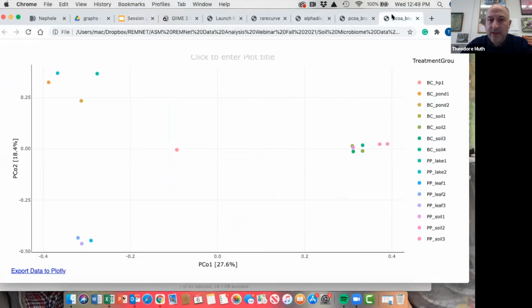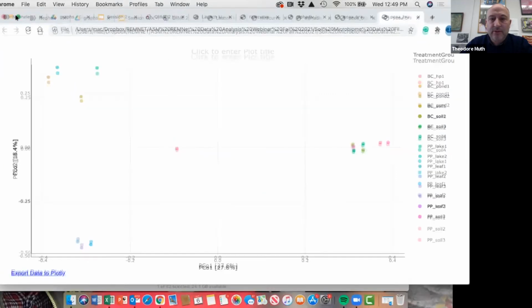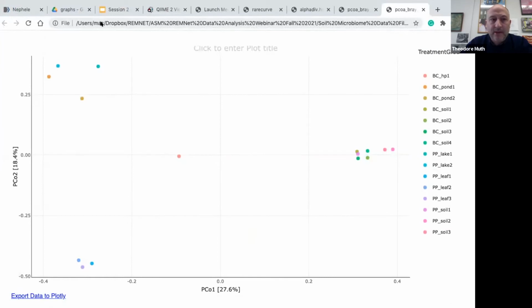And let me just go back to here. There is a pretty good description of how these PCOA plots are generated on StatQuest. Essentially, these are beta diversity measurements that are looking across samples and comparing samples to one another.